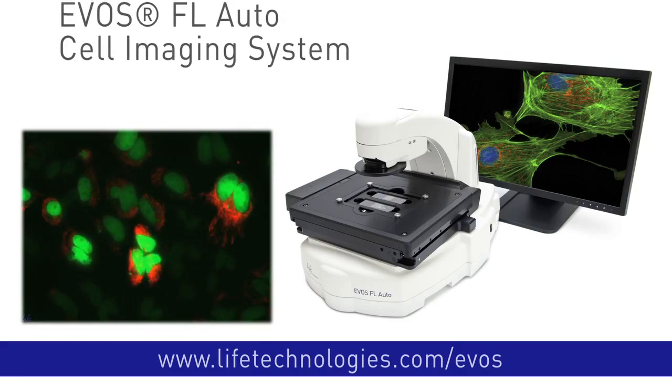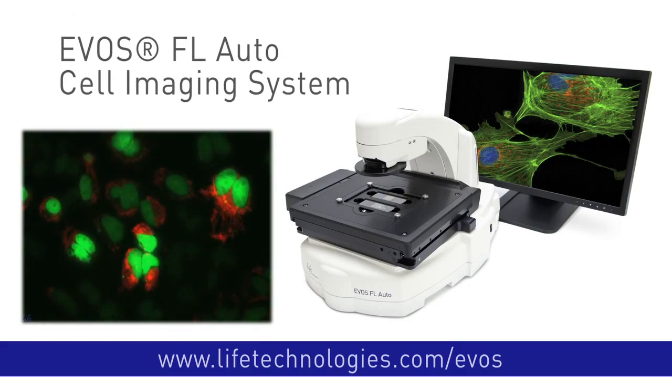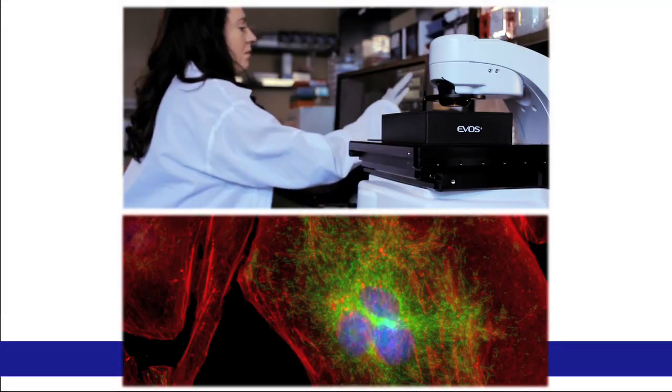By removing the complexities of microscopy, the affordable, intuitive EVOS cell imaging systems have revolutionized the way researchers use microscopy to image cells.